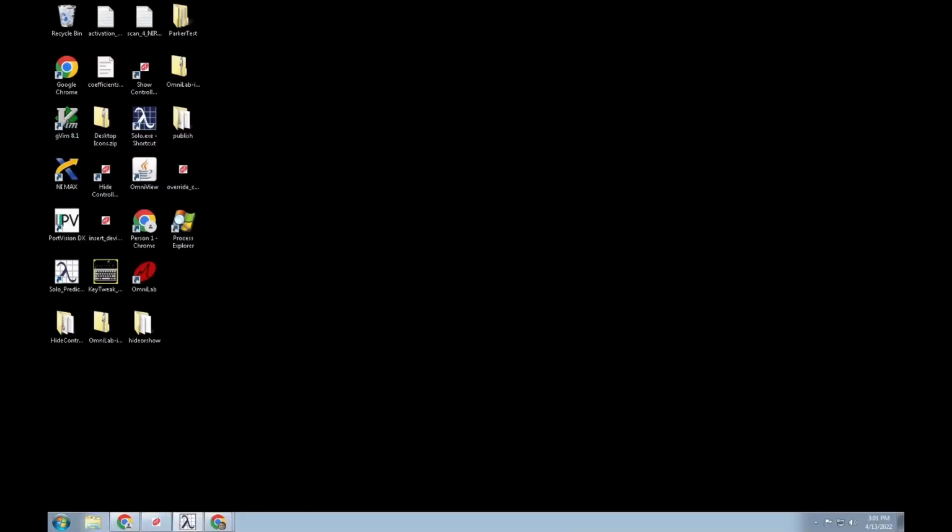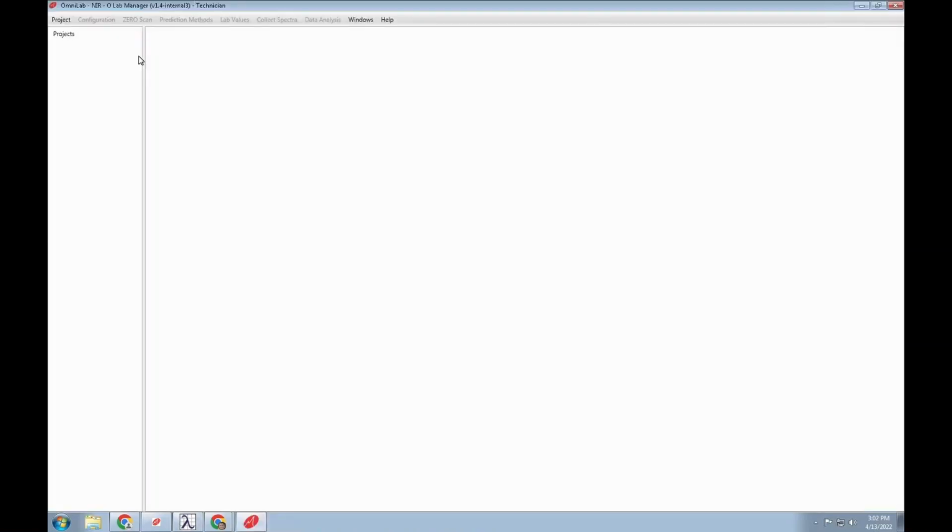In this video, we're going to show OmniLab users how to create a project. The first step, of course, is to start OmniLab by clicking one of the shortcuts created by the installer. To start a project, or create one, you click on the Project menu bar button up here. And you'll notice that there's no way to do that.